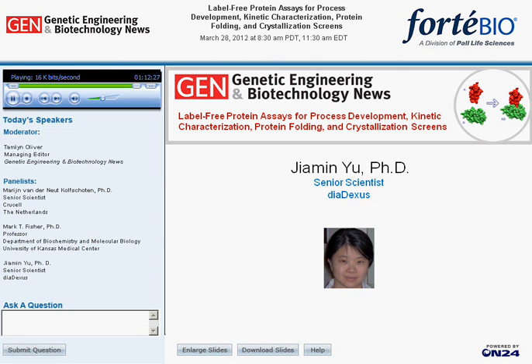That's a great question. So the way I looked at it is that, say, you have 100 samples and you coat the sensors yourself. Each sensor costs about $4, and then you spend a couple hundred dollars buying the anti-His antibody from Qiagen, which for, I can't recall the amount, 100 micrograms or so, you can use for quite a while. So each sensor is $4 for 100 constructs. That would cost about $400. Let's say if you want to repeat the assay, that's $1,000.